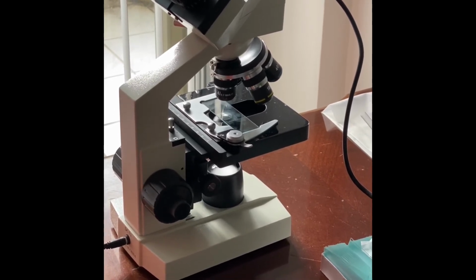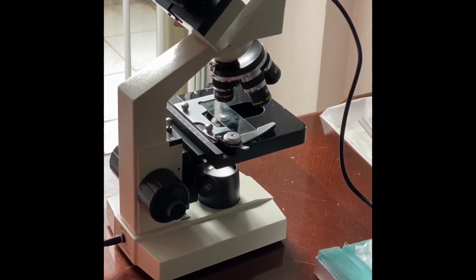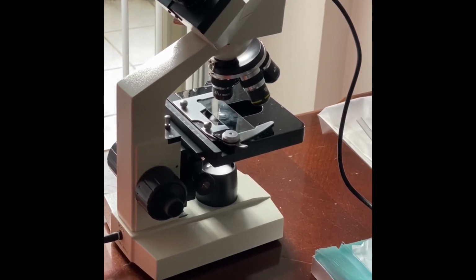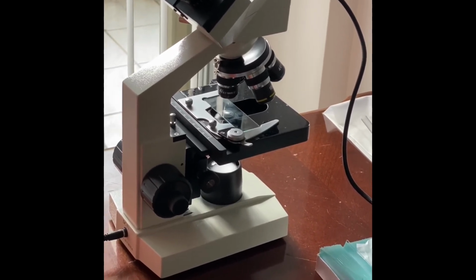What did you conclude? You concluded that the magnification of the letter E was inverted. That's a function of the microscope. It inverts the image. So that's your conclusion.